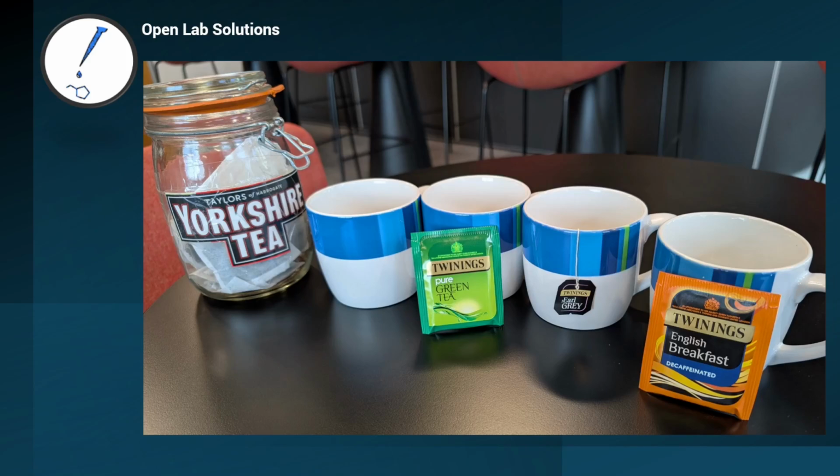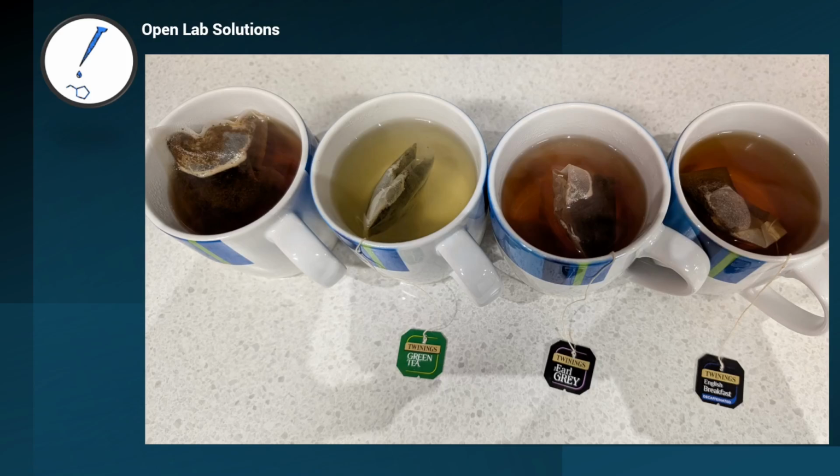So for this simple comparison with teas, how much caffeine is in these teas, we've got our English breakfast decaffeinated version. I'm going to compare this to the Earl Grey, to green tea, as well as a Yorkshire tea. And I've made 4 cups of tea using standard tap water, boiled that in a kettle, and then allowed these tea bags to brew in the cups for about 5 minutes.